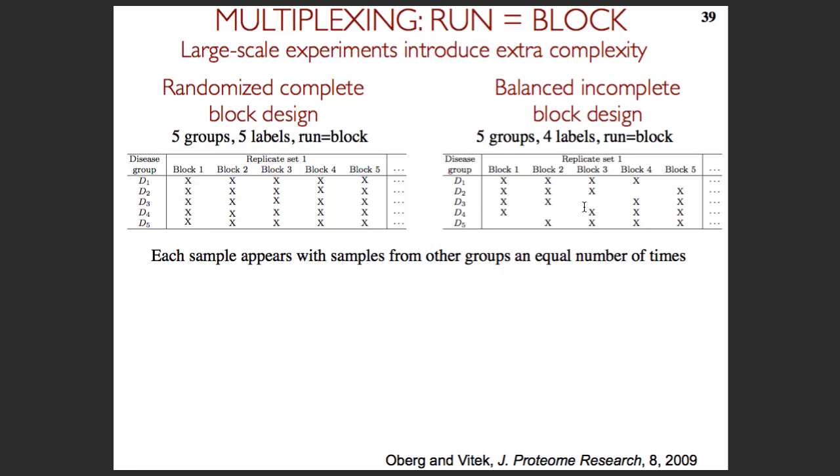Yeah, because oftentimes when I think about using multiplexing strategies like this, it's to minimize the number of runs. Of course. But you can introduce variation at the MS1 interference level, at the labeling level, right? And of course, there are other issues, as always with pooling, right? If you have 1 sample compromised, the entire pool is compromised. If you lose 1 run, you lose a lot more replicates. These are very multifaceted considerations, right?